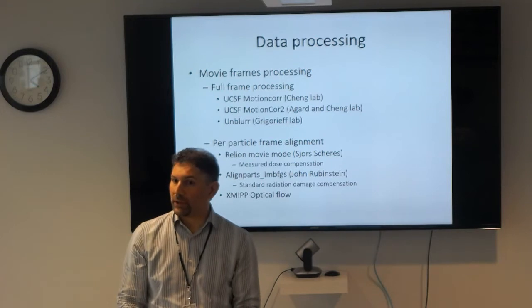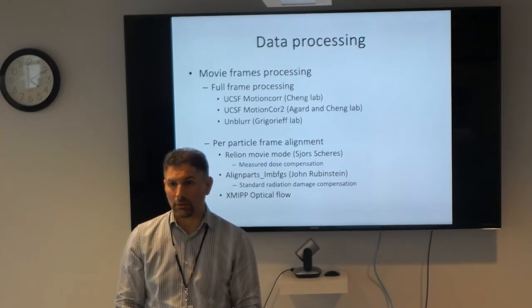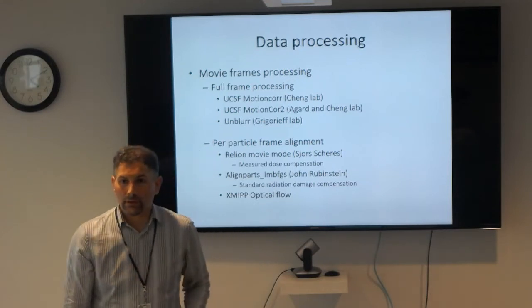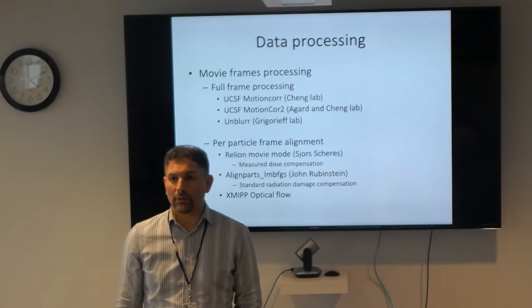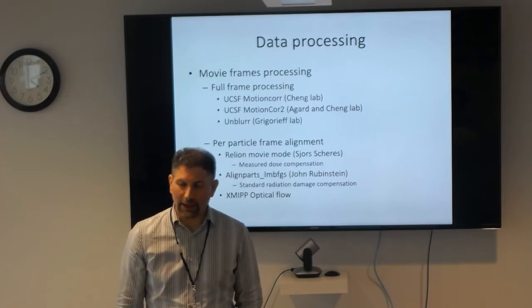Okay, so what do you mean by Relion tells you to keep it or throw it out? No, Relion just said that if you see a class average that has some spikes or some noise, that usually means there's noise in there, and you should throw it away, right? But now I see that you started to say that there are some rare views in very few particles, so you just go directly to 3D. You think that if you go for 2D, these rare few particles will belong to some junky class? It might get, yeah.